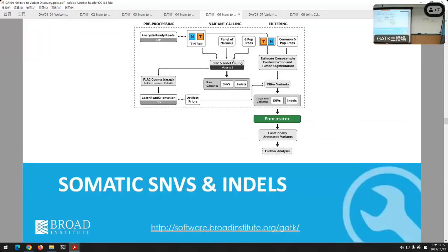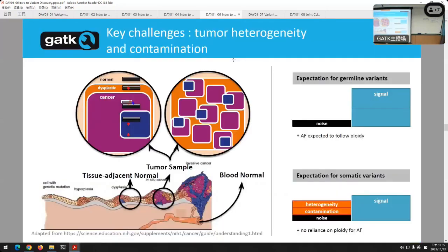Somatic cancer is different. Now, there's always an argument between the folks from my team who do germline work and somatic work. Which one is harder? All right, so the germline folks say, come on, look, the somatic mutations are generally huge. It's so easy. All right, but the somatic folks will say, it's way more difficult to do cancer calling. Okay, so why?